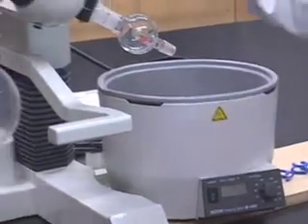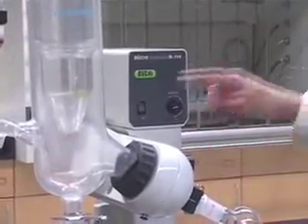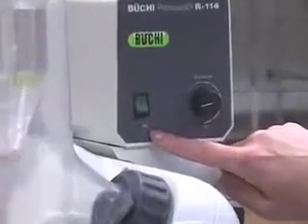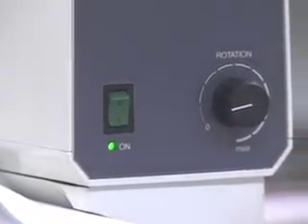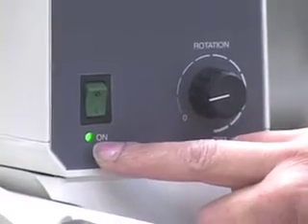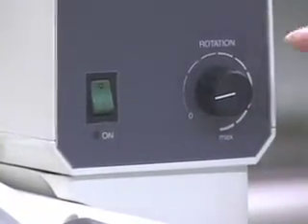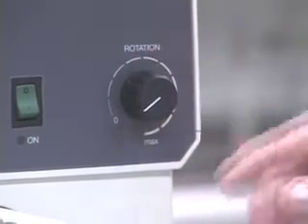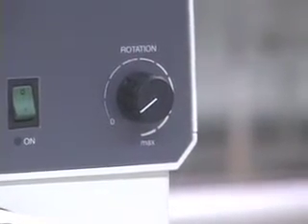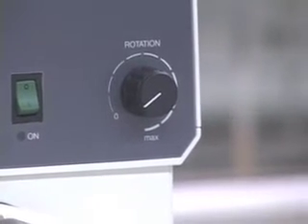Next, this is really the actual motor part. Here is the on off switch. You press it to turn the machine on. You notice that the light is lit here and you can press it back to turn it off. The dial that you notice here is used to rotate the system. That's actually where the name Rotovap comes from.